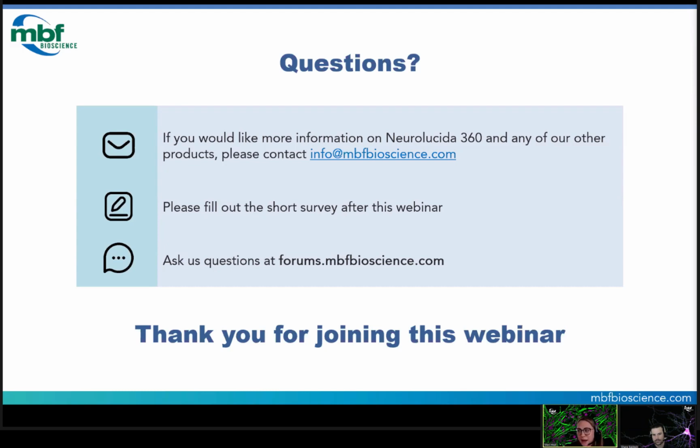The next release of Vesselucida 360, which is coming anytime here early in the new year, will also have this batch pipeline in it. It'll be brand new to that software, so you can make use of that great vessel filter, enclosing filter, and the automatic algorithms that are in Vesselucida 360 to do this type of streamlined analysis.